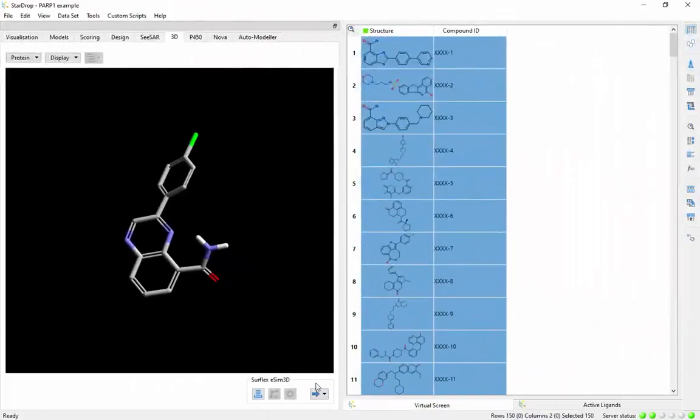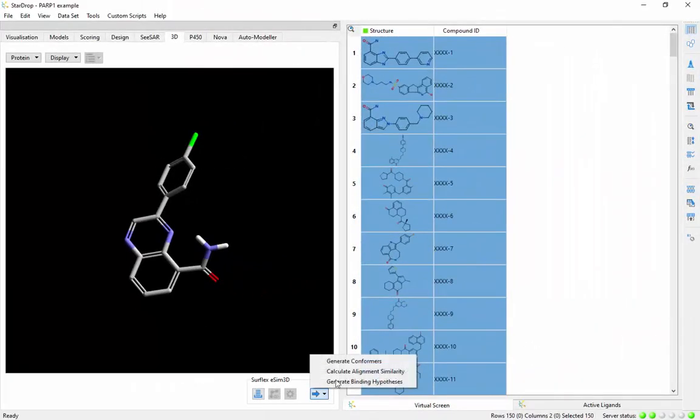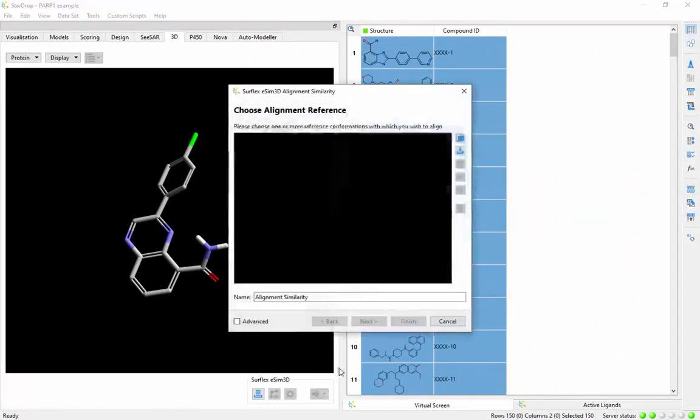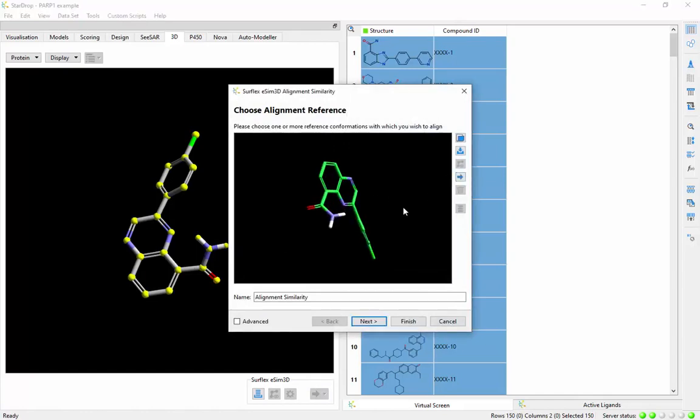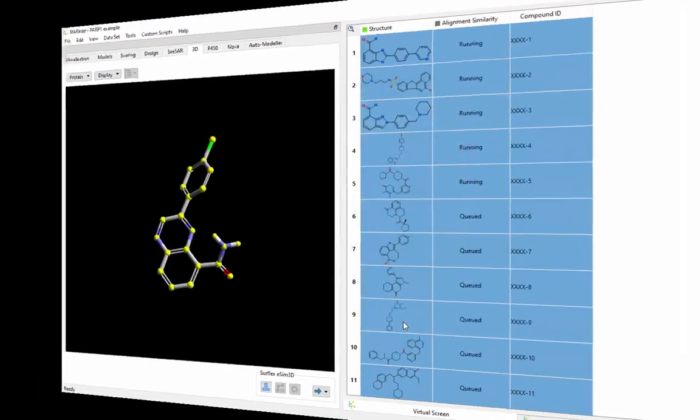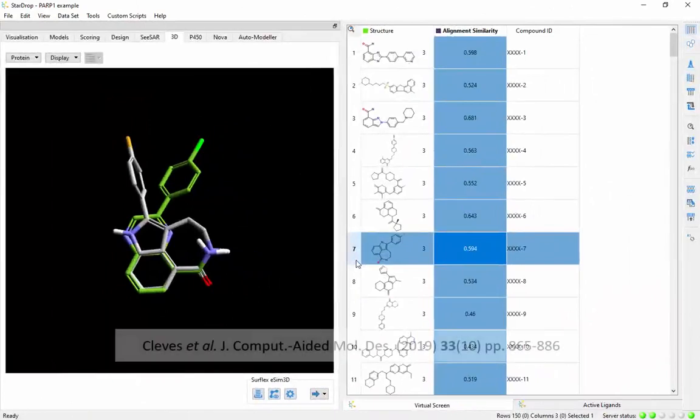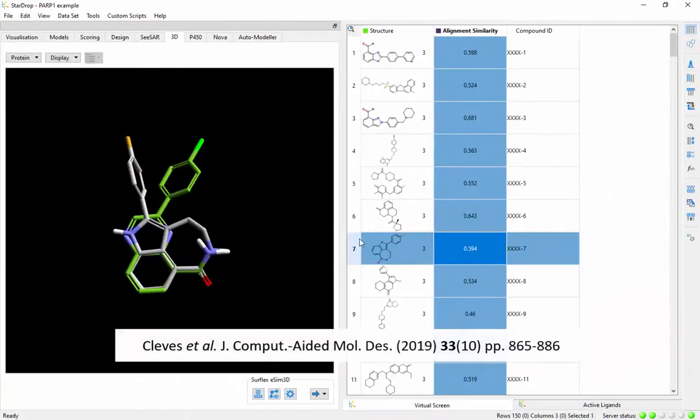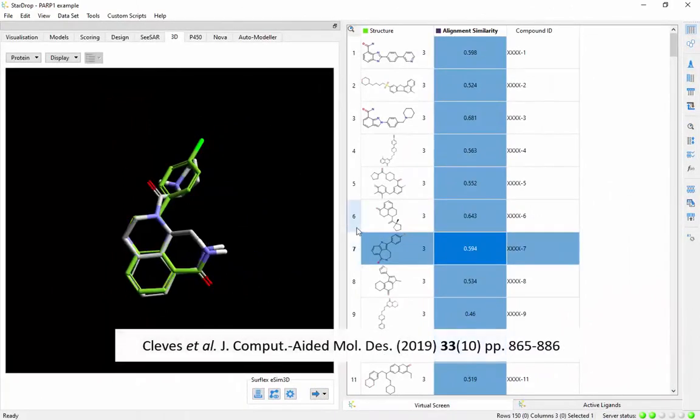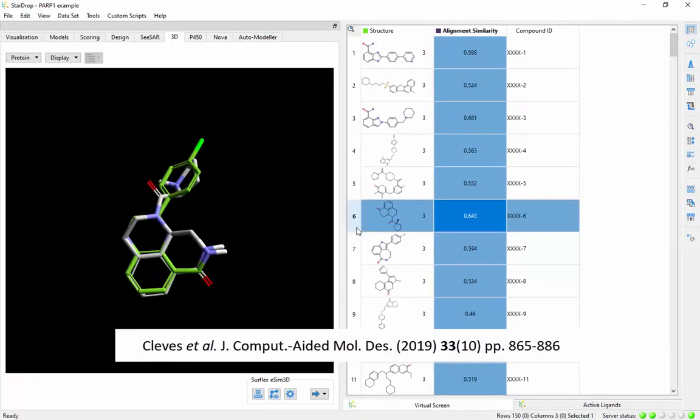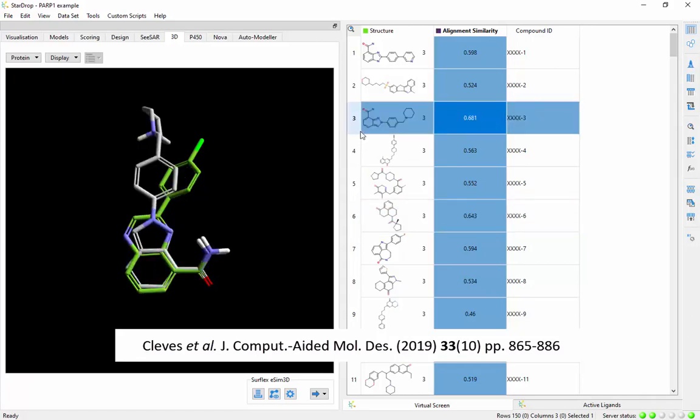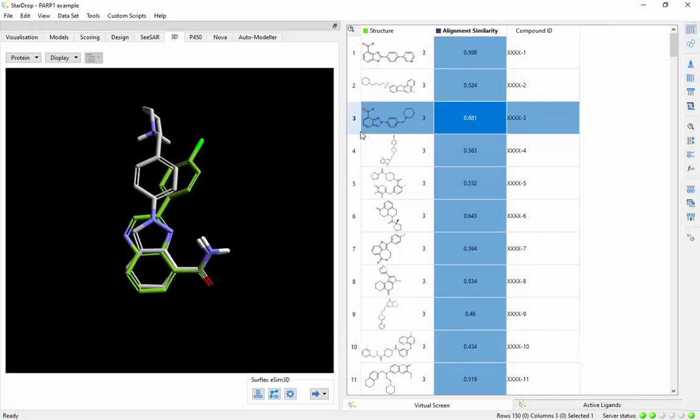You can find novel potent compounds by performing 3D virtual screening against known actives. Rigorously validated pose prediction helps you understand the 3D structure-activity relationships that will guide further optimization of your compound's potency.